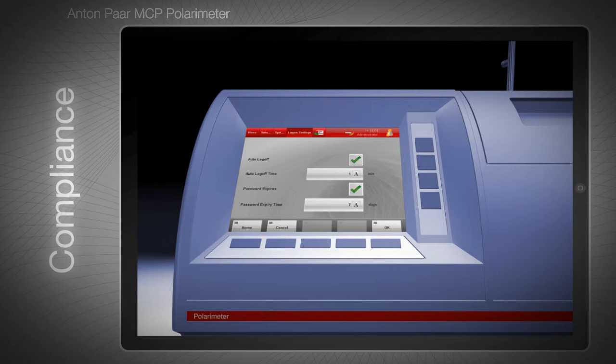When the pre-configured security level 21 CFR Part 11 is selected, passwords automatically expire after a defined period. Additionally, passwords have to adhere to the 21 CFR Part 11 requirements — for example, lengths of at least 8 characters. Passwords also have to be unique and different from previous passwords.